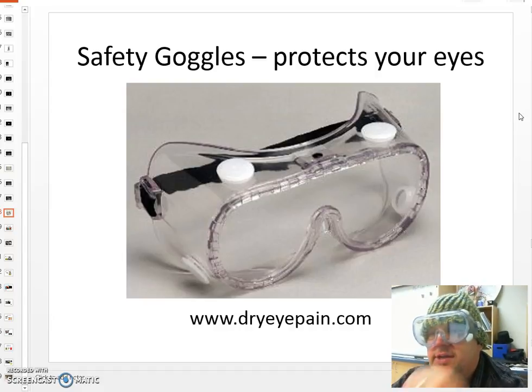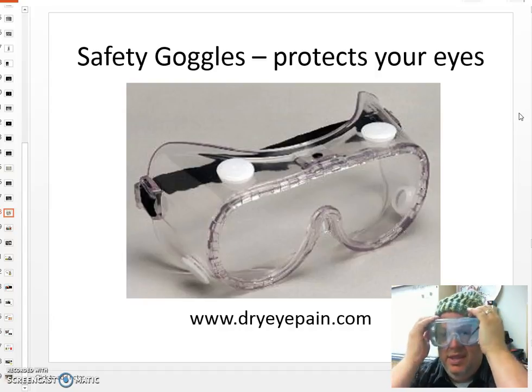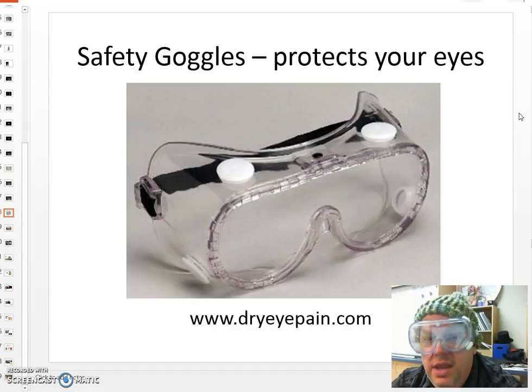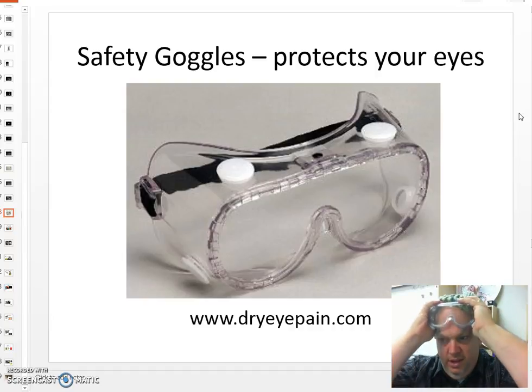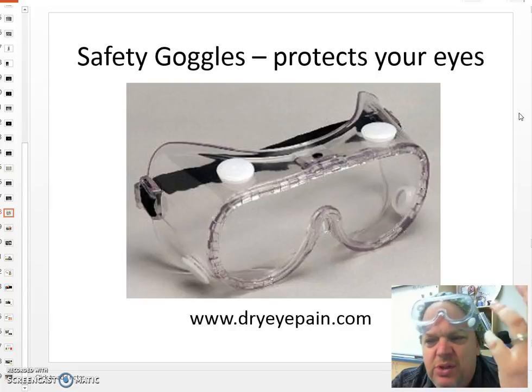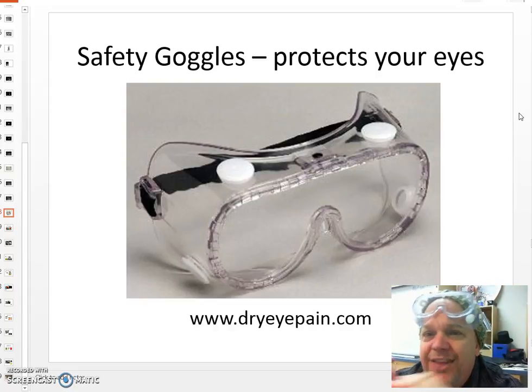Now, this is actually the correct way to wear it. Now, I have to move my beanie up a little bit, and all right. So this is really the proper way to wear the goggles. Now, people have used the goggles in an improper manner, so let's take a look at that. One way is they wear it over the forehead. They're a little tired, their eyes are hurting a little bit, and they're still in the middle of the experiment, and then they want to put that up in the forehead. That's great!